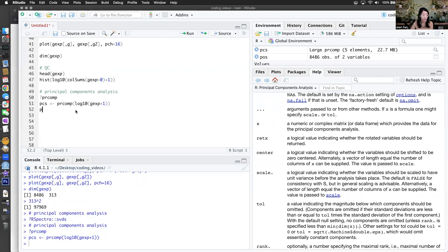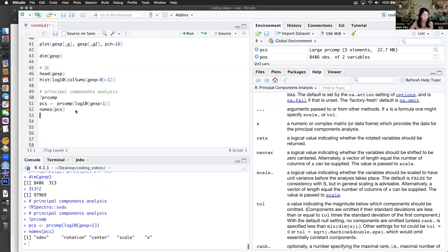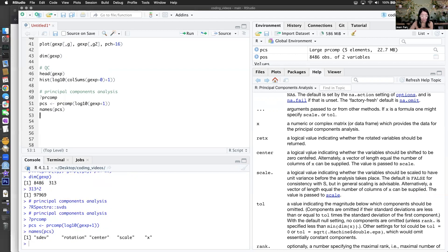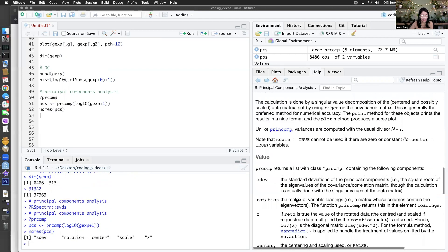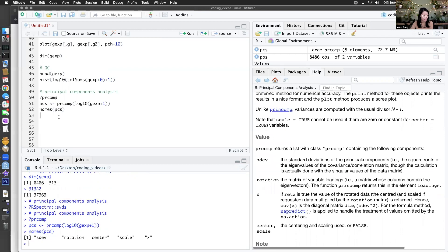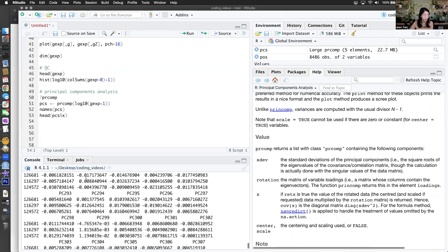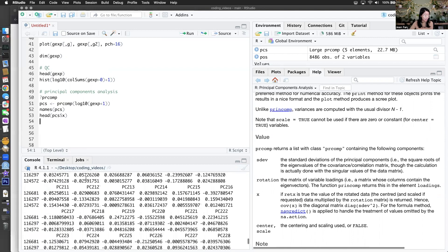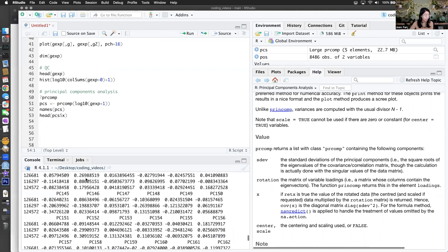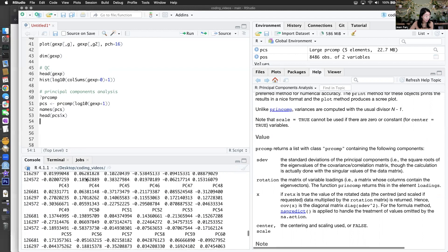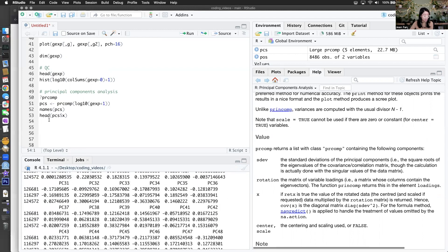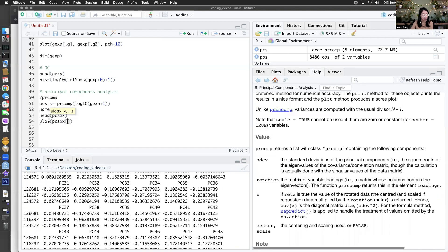We always want to check what the outputs are. We can also read about it. I think what I want should be in here — the x component is where my principal components are, and those have the dimensions of my cells. What happens if we just plot the first two PCs?